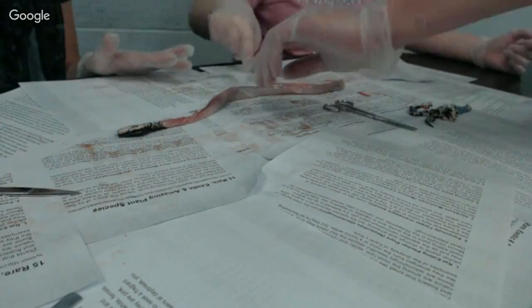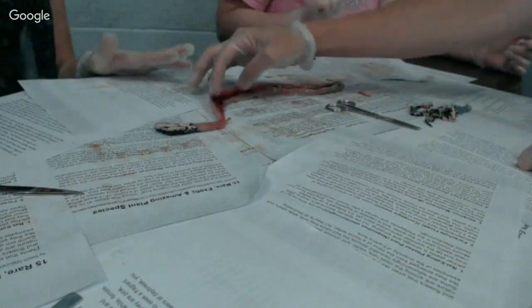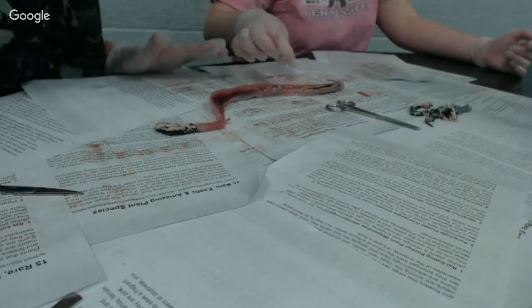And very good. Now, that's fine. The innards. Okay, what is that? The heart. Good job. Find the lungs. It's the heart. Yep, right there. Do we have to take it out? No, just find it. What are these white things? Are they eggs? No, those might be fat.